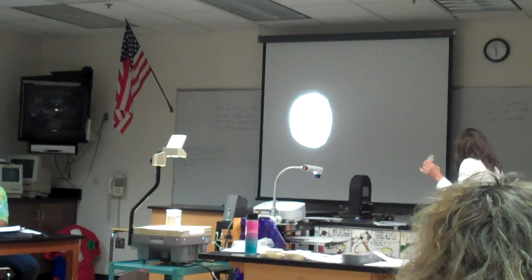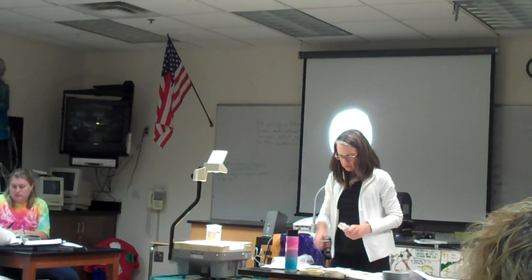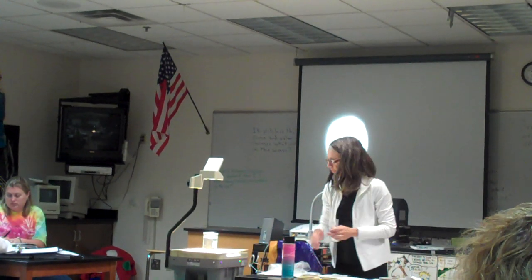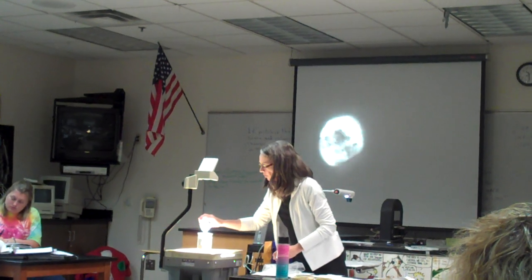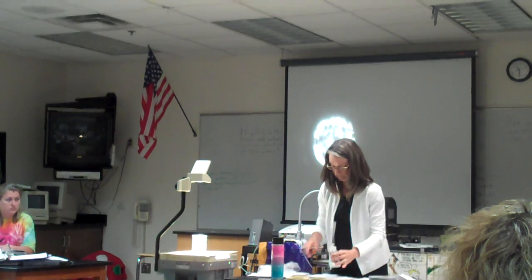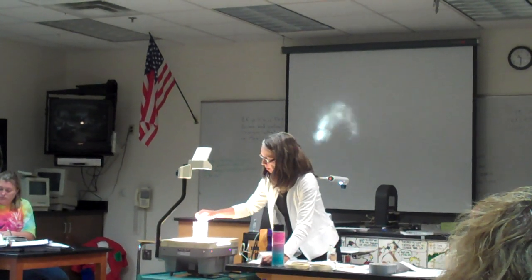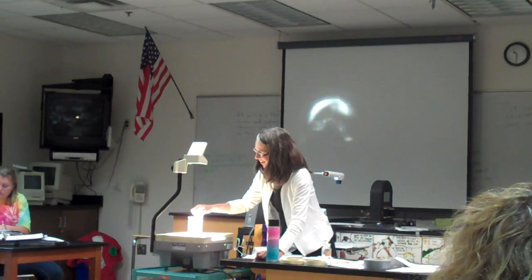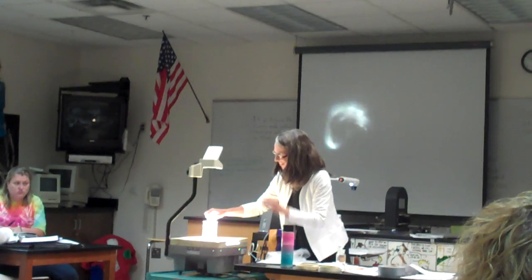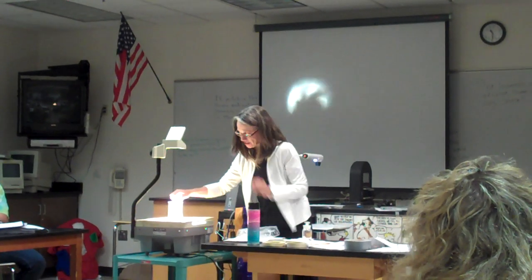Okay, it's a beautiful crystal. I don't know how much. That much. Not too much, though. Right, because if you did too much, everything happens too fast.